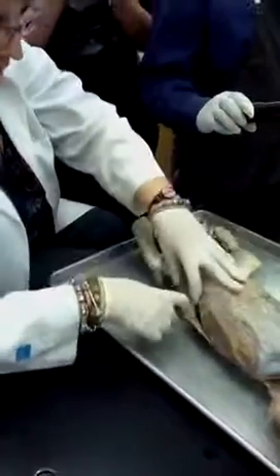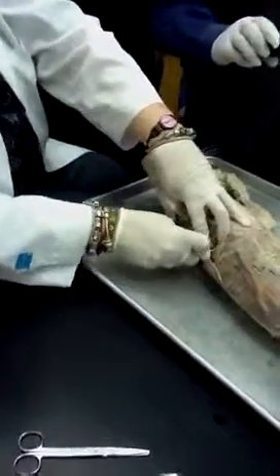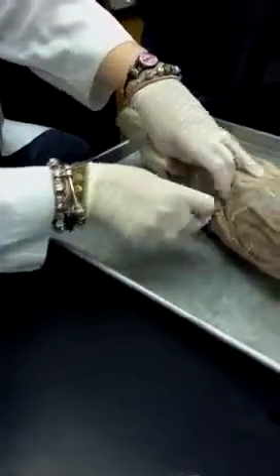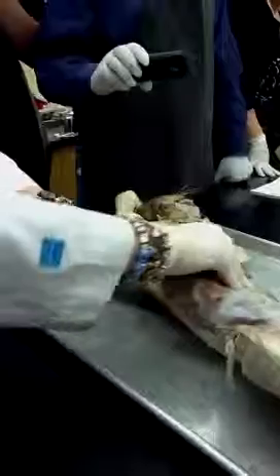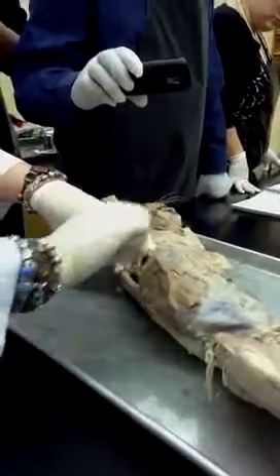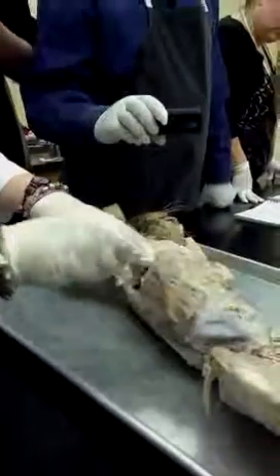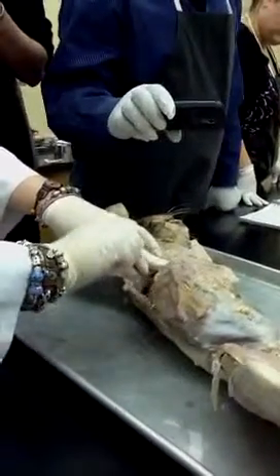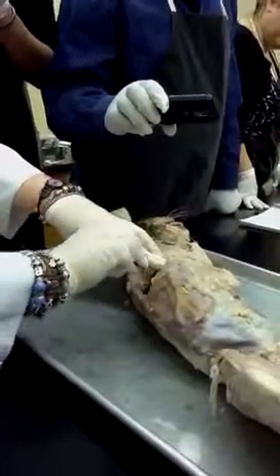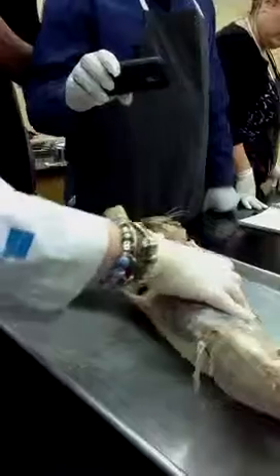It's like a serrated knife. Did we do it over here? It's a muscle that's deep in here. It's called the serratus anterior in humans, but the serratus ventralis in the cat, and it looks like a fan in here.